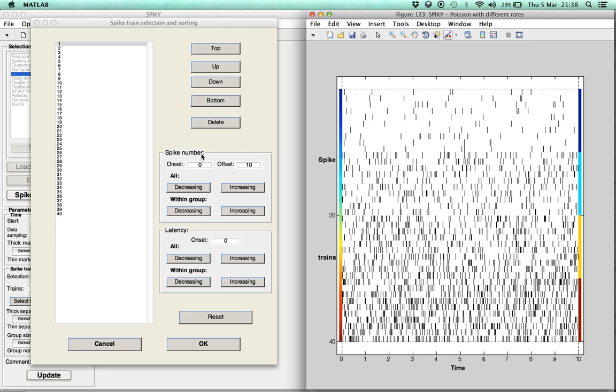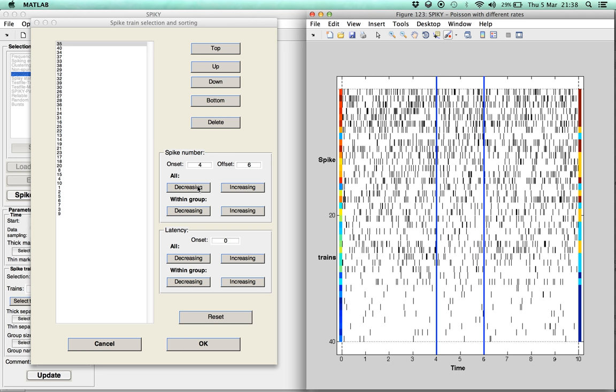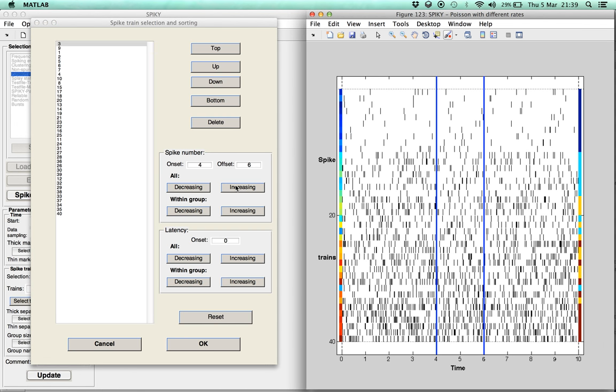For spike number, you can look at the whole dataset, but you also have the option to restrict the relevant interval to a smaller range. Here we choose the limits 4 and 6. Then you can either let the spike numbers in that interval decrease or increase.